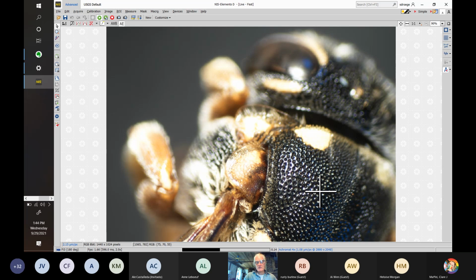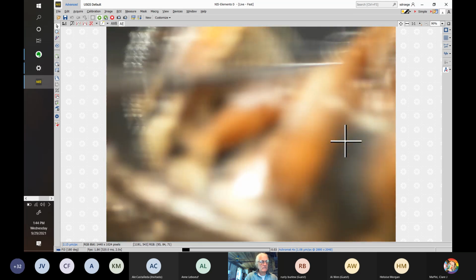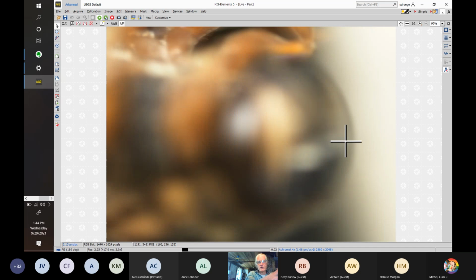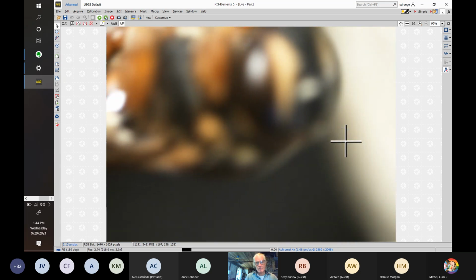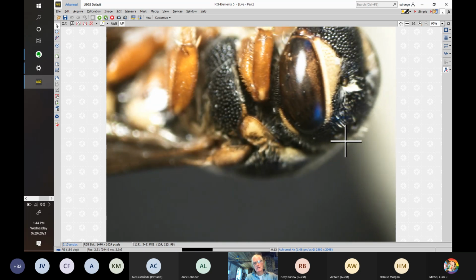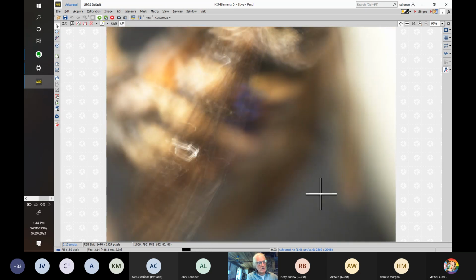Okay, so let's see if we can see the edge here and its relationship to the pronotum and the cliff-like aspect, as they say. And then we'll go to the front and rear face. Dianthidiums are just full of characters. Parts of the identification. So maybe I want to twist this a little bit more this way, perhaps, to see it.